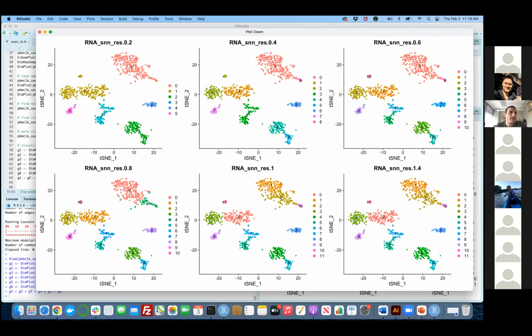For example, when I asked, Simona told me that I would probably pick this cluster apart into 2, which is basically what is happening as I increase the resolution further, right? So I have 4, 5 over here, 3, 5 over here. Their labels are different. They are different numbers, but basically they are the same cluster. So the label will be different, but the partitioning will be the same.